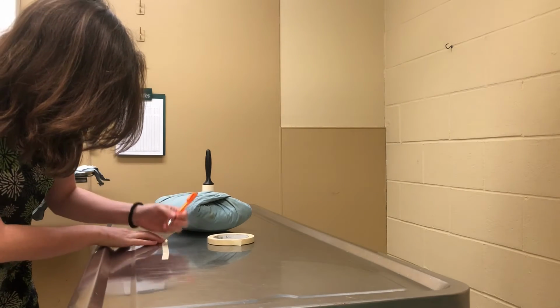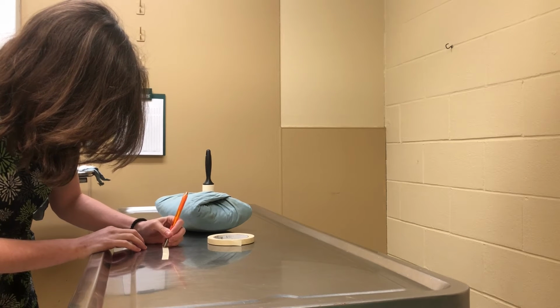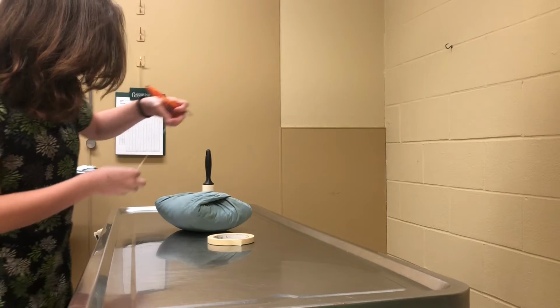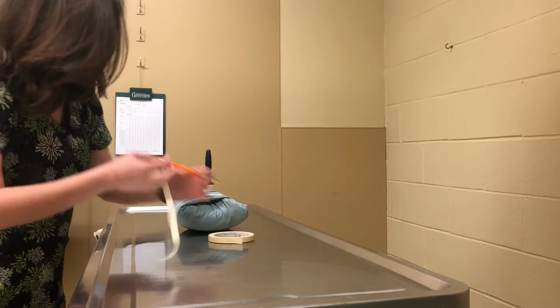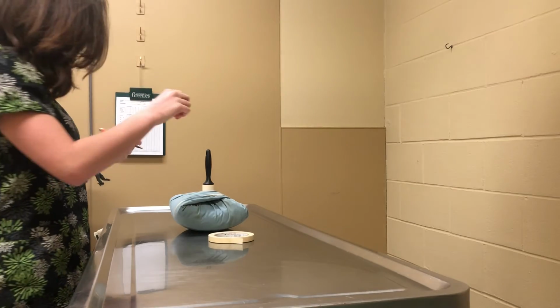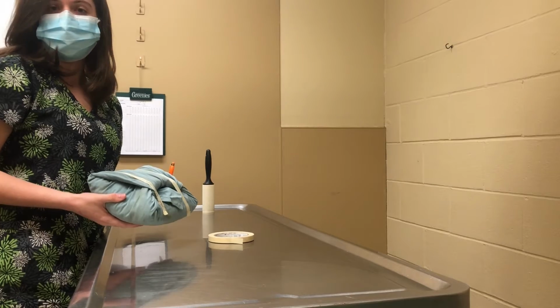And this is surgery gown. Put that on one side here, and I'm going to put the other one on the other side. And now this pack is ready to go into the autoclave.